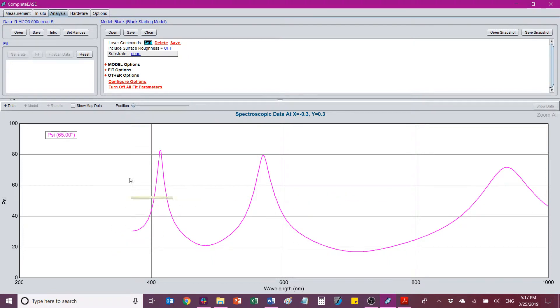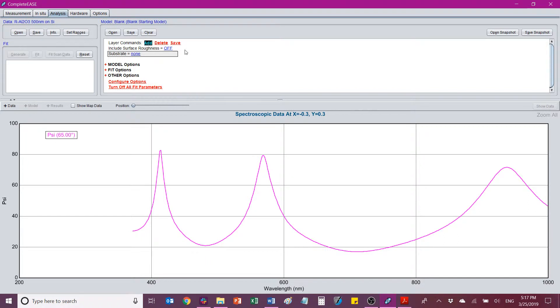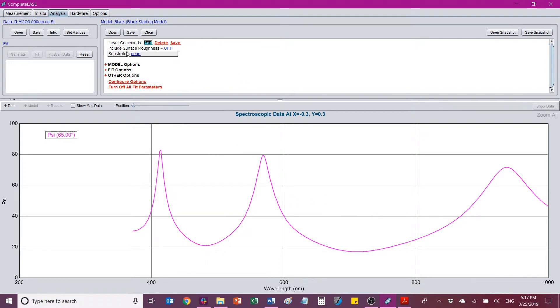So now that we have our data file open, we're going to start building a model to explain this data in terms of thickness and the optical properties that the material has. So in this section, we'll start to build a model. You can open existing models or save a model once you've built it. For example's sake, we're going to build a model from scratch.